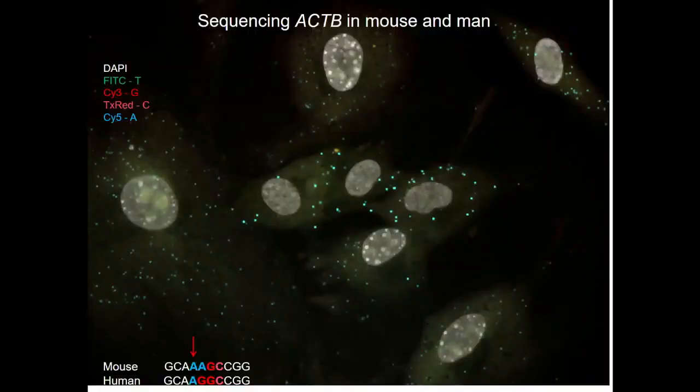So here's the data from our first in situ sequencing experiment. We're sequencing a bit of beta-actin in mouse and man in a co-culture of mouse and human-derived fibroblasts. So here's the incorporation of the first. Okay, so in mouse, this sequence we're targeting reads AAGC. In man, it reads AGGC. So here's the data from the first base incorporation.